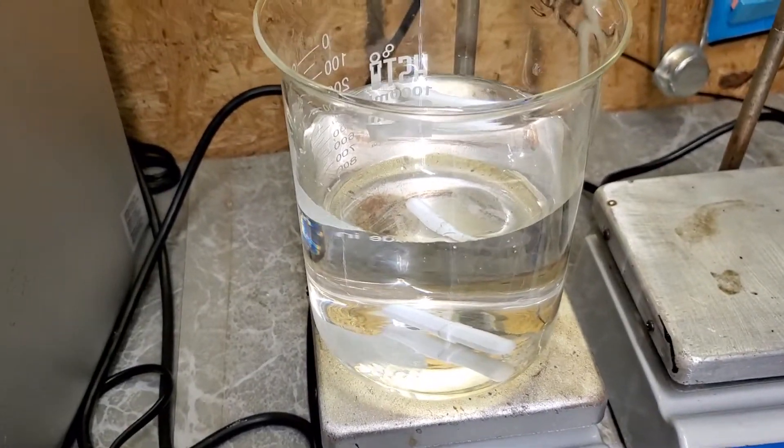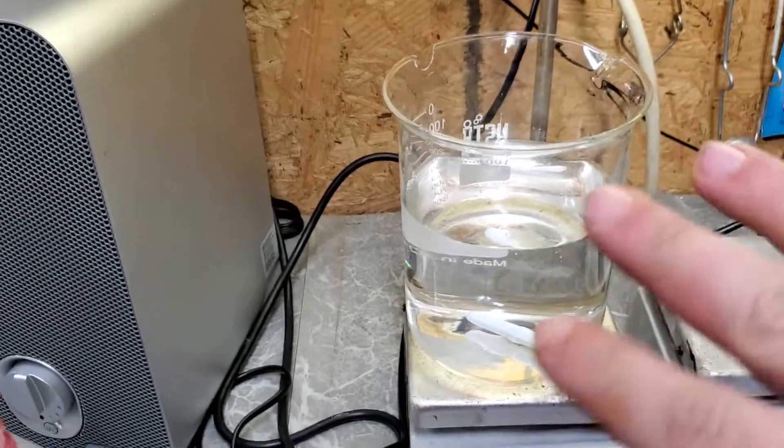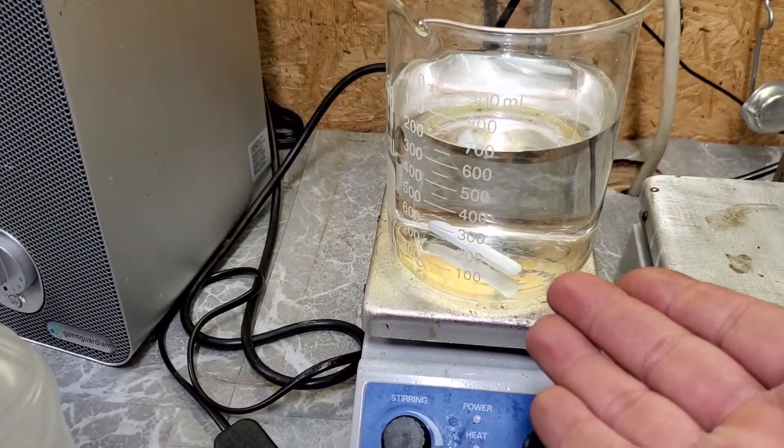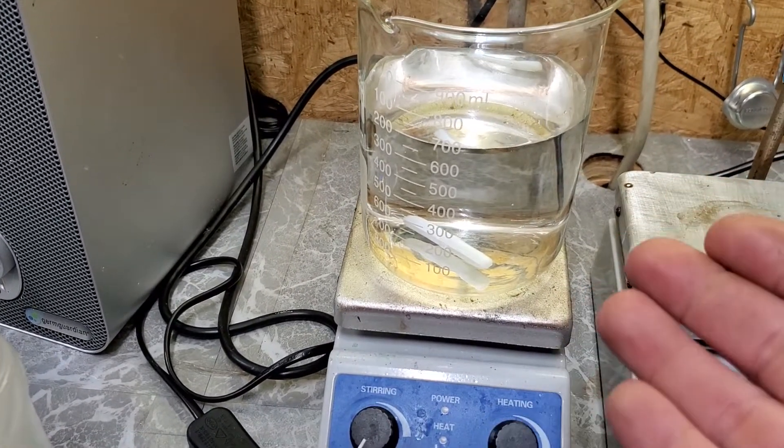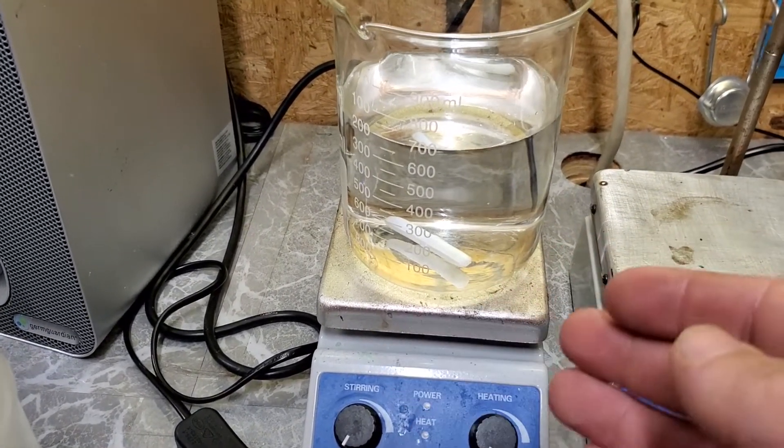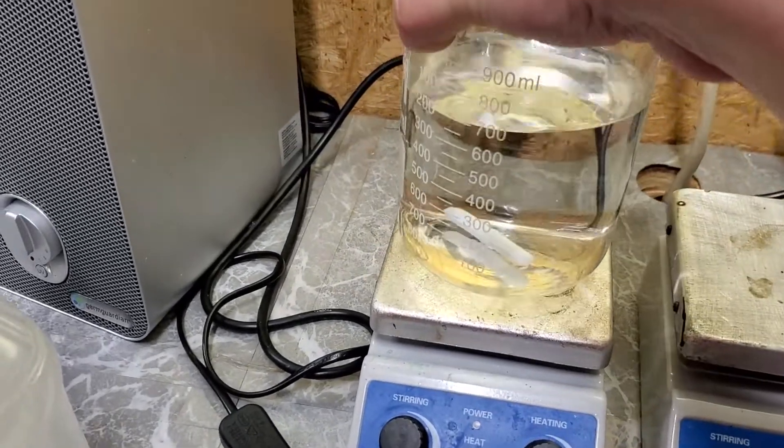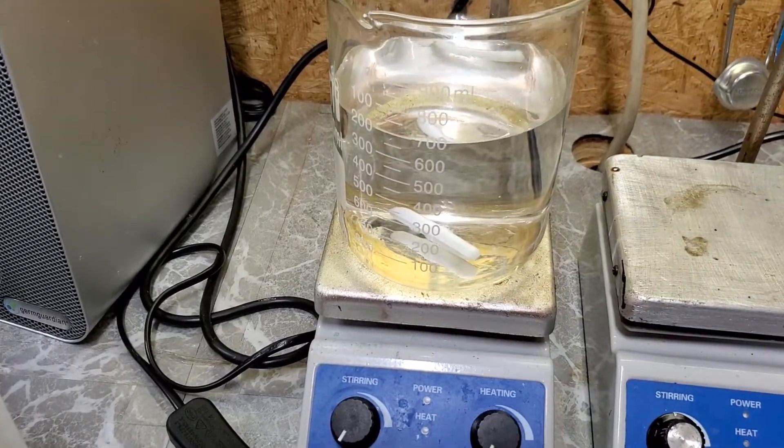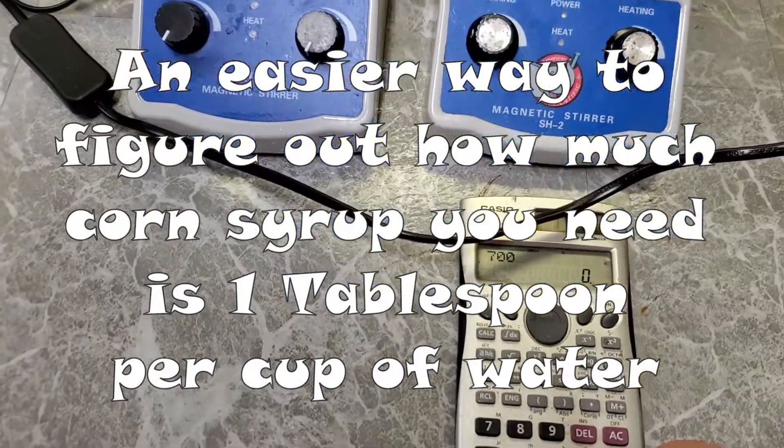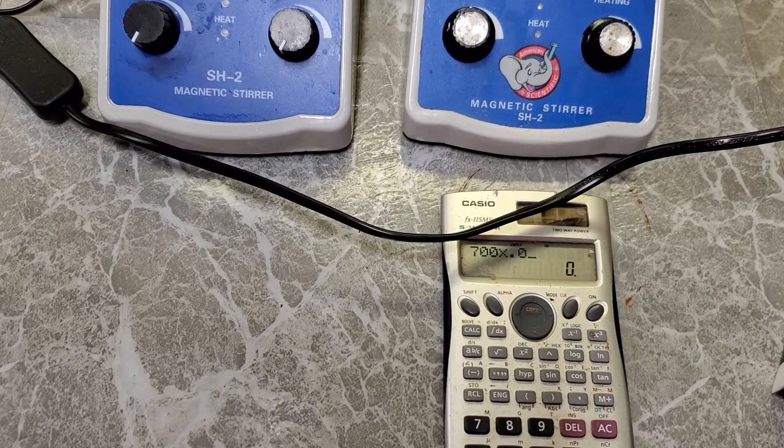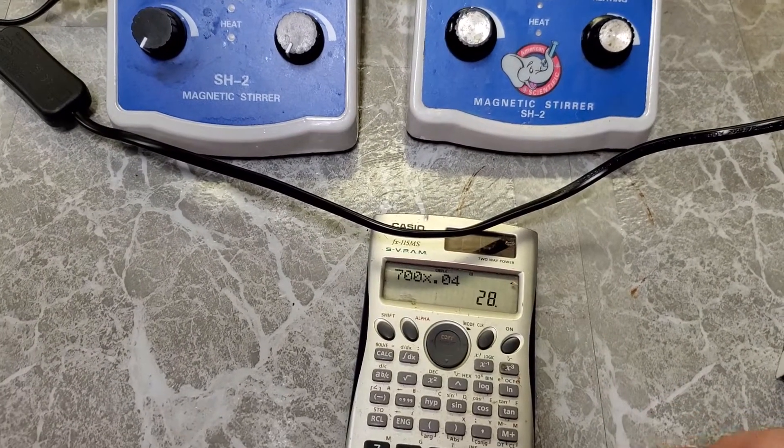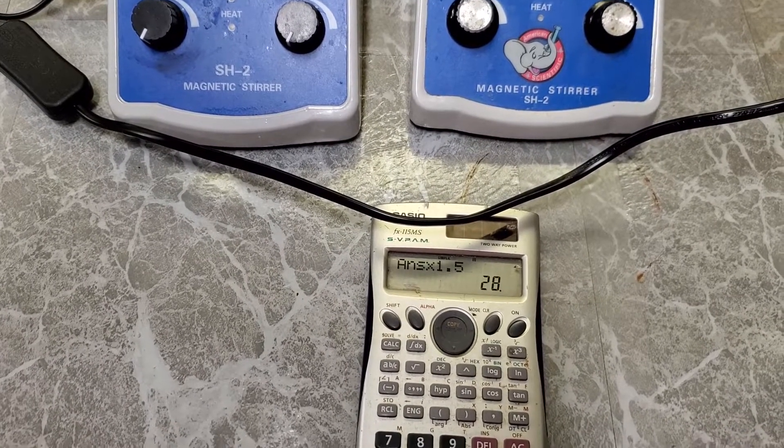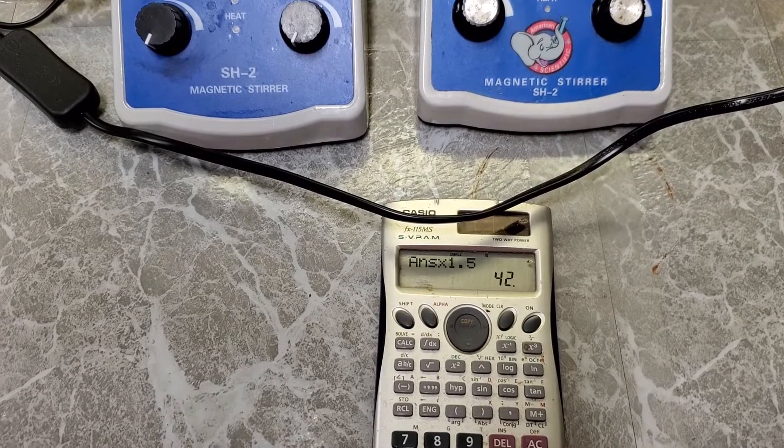You want approximately 4% corn syrup to water by mass. So since we're doing 700 milliliters of water here, 700 milliliters of water will weigh about 700 grams. One cubic centimeter of water is equal to one gram. One cc of water equals one milliliter. So this is approximately 700 grams of water. Let me do some math real quick. So 700 times 0.04, 28. Since corn syrup has a density of about 1.5 grams per milliliter, we need about 42 grams of corn syrup in here.